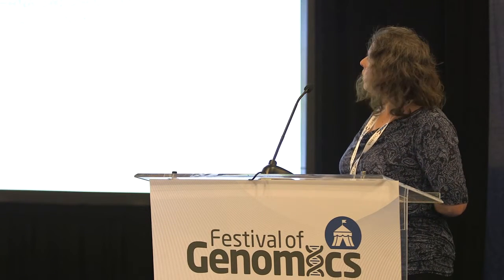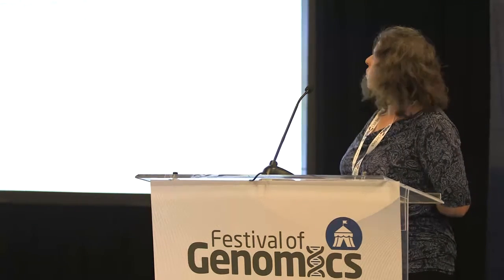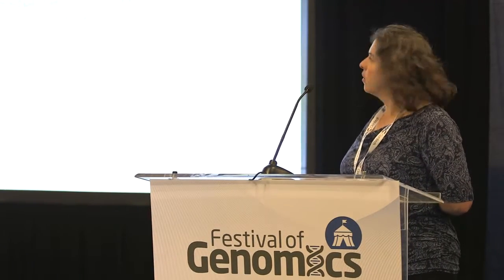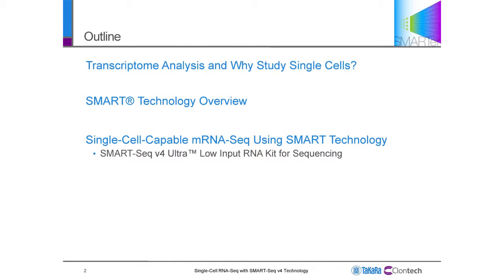So just a quick agenda. I'm going to start off by talking about transcriptome analysis and why we study single cells. And then I'll do an overview of the SMART technology just to make sure we're all on the same page. And then I'll talk about the single-cell capable mRNA-seq using the SMART technology, using the SmartSeq v4 ultra-low RNA kit for sequencing.